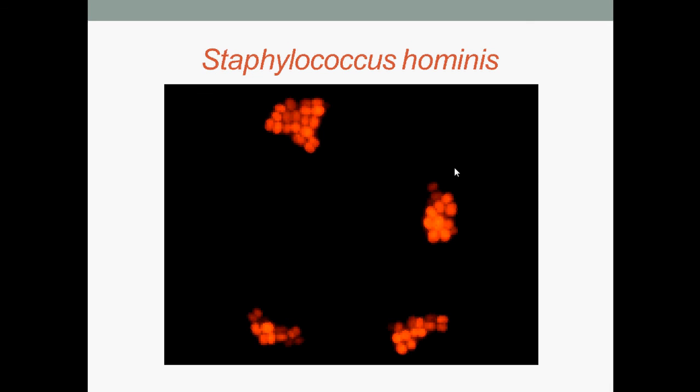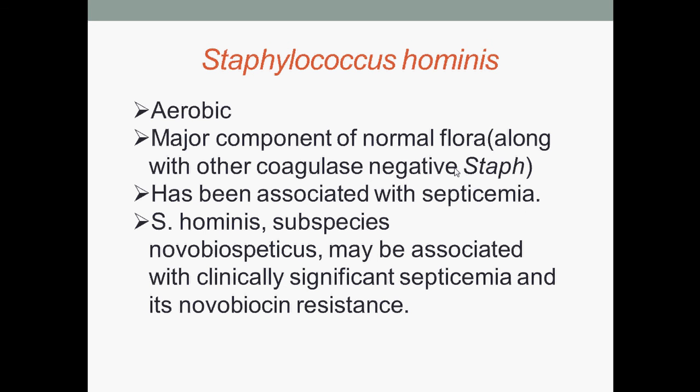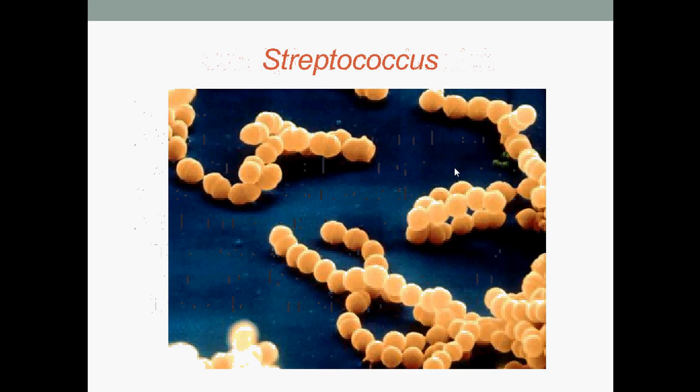Staphylococcus hominis under microscopic view. Staphylococcus hominis are aerobic. They are the major component of normal flora along with other coagulase negative Staphylococcus species. Has been associated with septicemia. Staphylococcus hominis subspecies novobiospaticus may be associated with clinically significant septicemia and is novobiocin resistant. That's all for today.